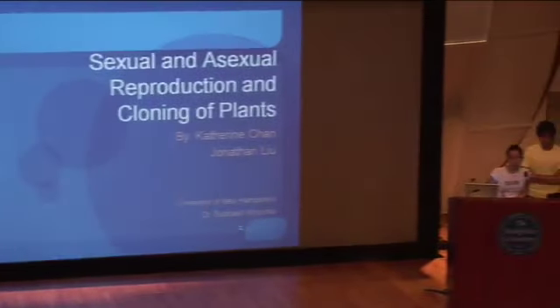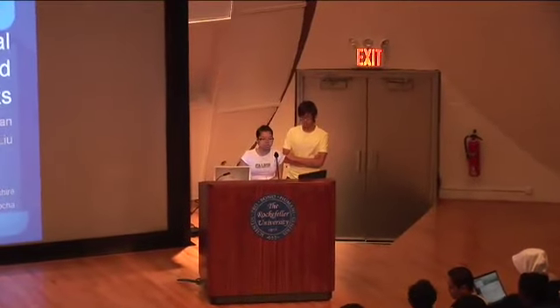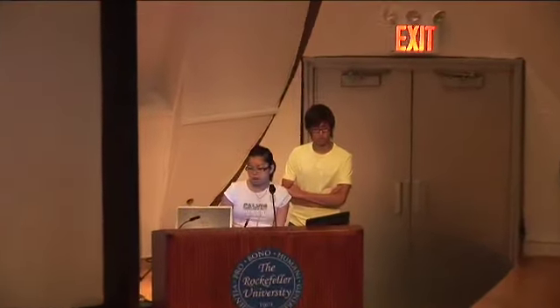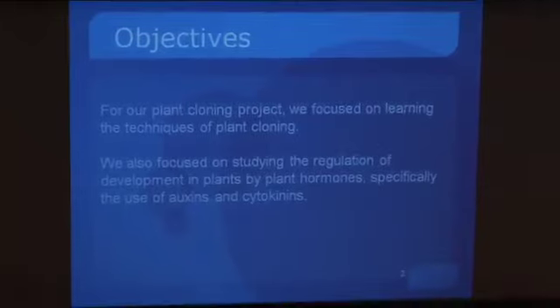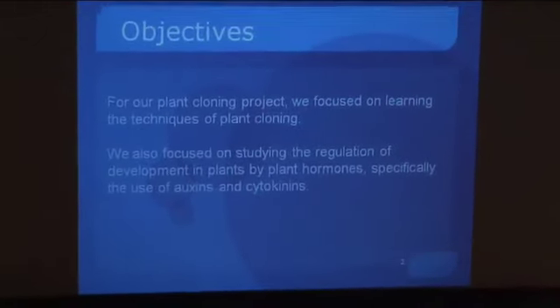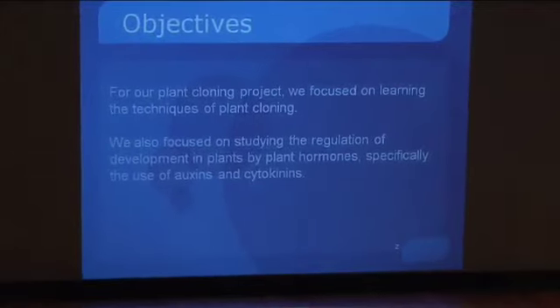Last year we went to the University of New Hampshire and worked with Dr. Suresh Manocha on plant cloning. Part of our project was to understand asexual and sexual reproduction, or cloning, of plants. For our objectives, our professor wanted us to clone plants. He set up an experiment for us, and we just followed the procedures to clone the plant.